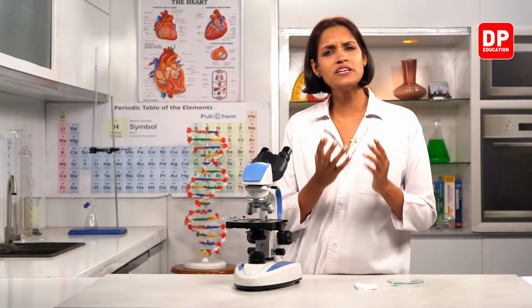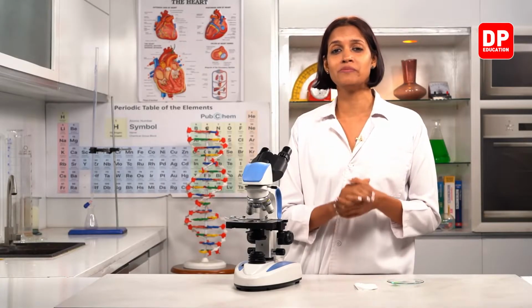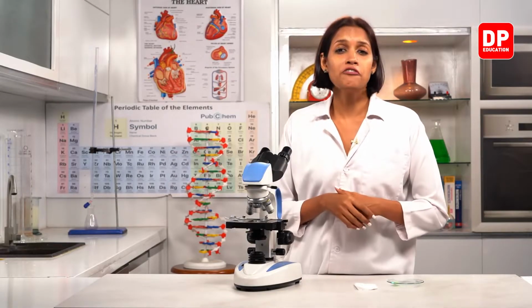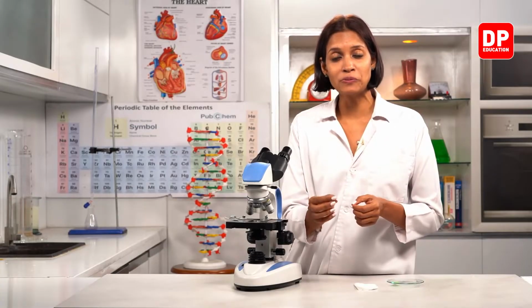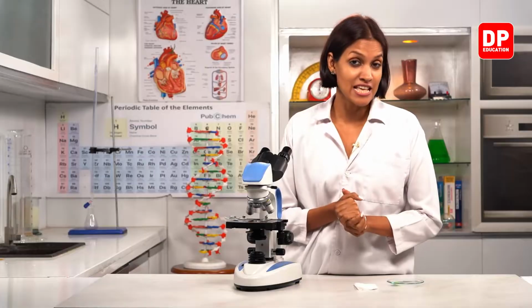Right, children? What is the importance of the presence of silica gel or calcium chloride? Because silica gel and calcium chloride can absorb moisture or water vapor present in the atmosphere. Therefore, in order to absorb all the moisture inside the desiccator also, we have to put some silica gel or calcium chloride along with these lenses.